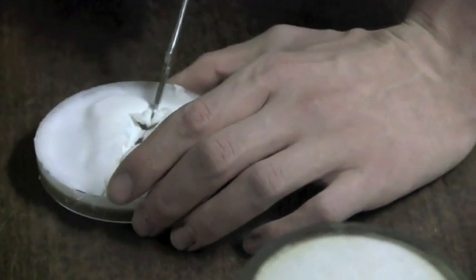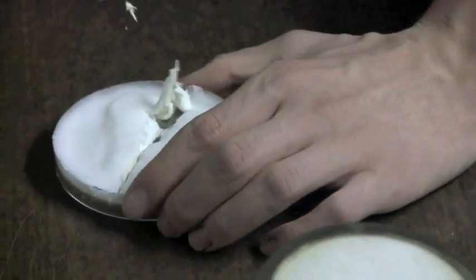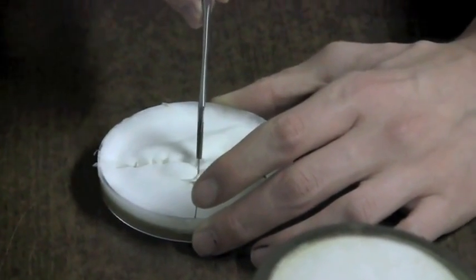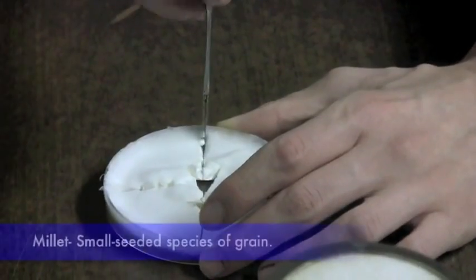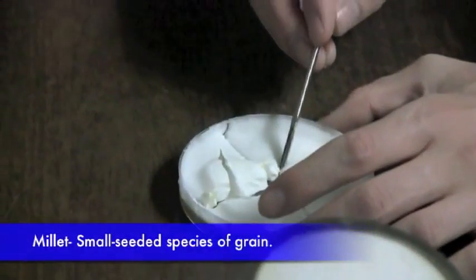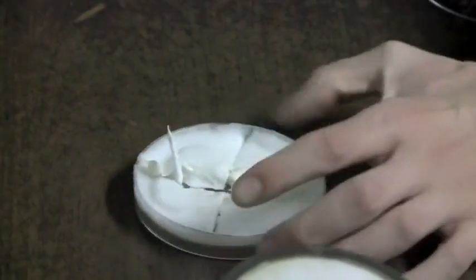Really a dense growth of mycelium. This is the finest mycelium we've ever grown out. We don't know if it's going to fruit yet, though. We got it from a guy in New Mexico. And every time we pour agar, Maureen likes to drop one little kernel of millet, which has been dried out. It looks almost like nothing's going to ever happen, and we get this rich growth.